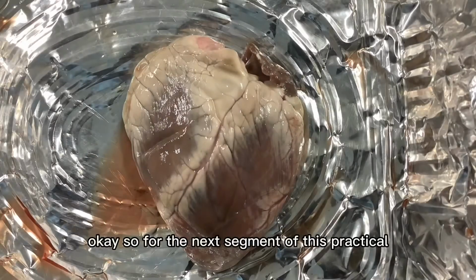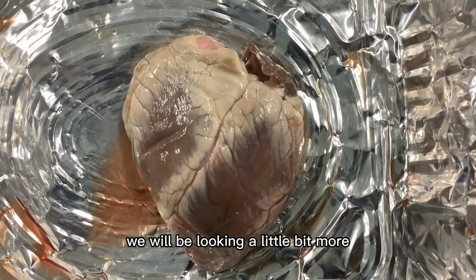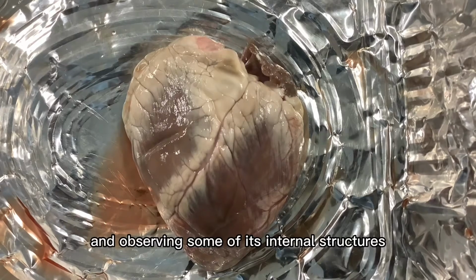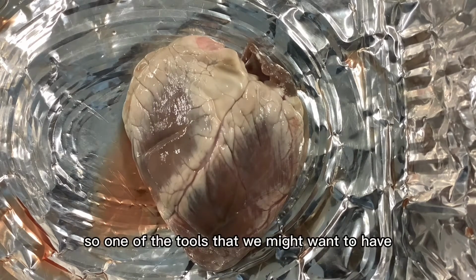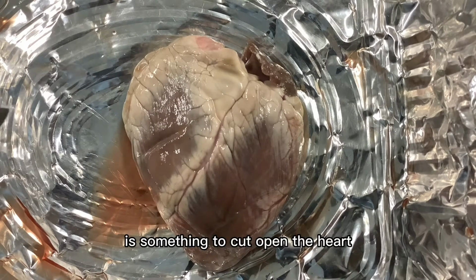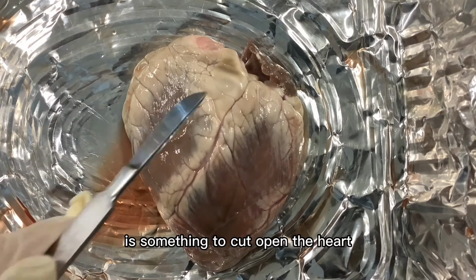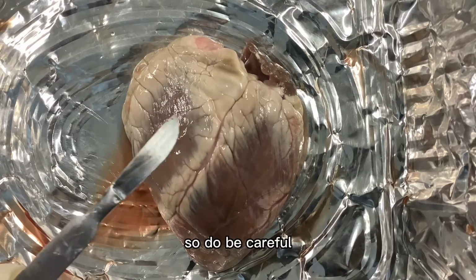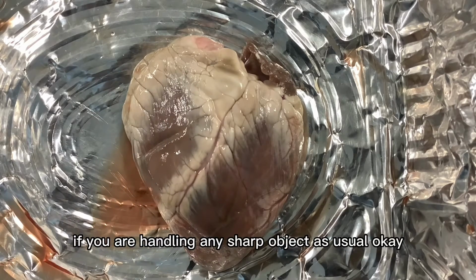Okay, so for the next segment of this practical, we will be looking a little bit more closely at our heart and observing some of its internal structures. So one of the tools that we might want to have is something to cut open the heart, and a scalpel will be quite useful for this purpose. So do be careful if you are handling any sharp object as usual, okay?